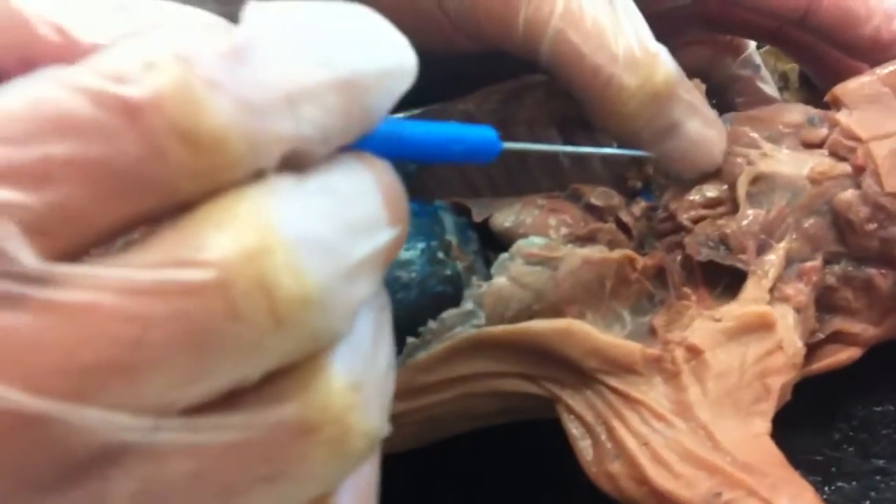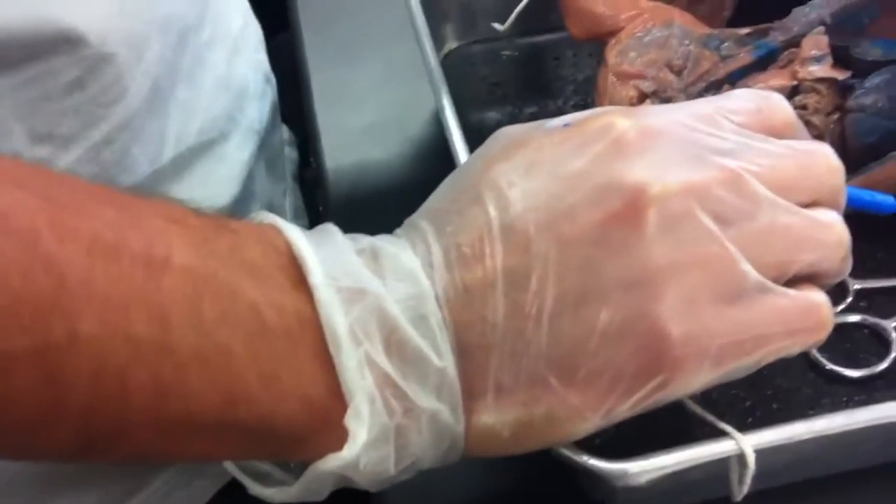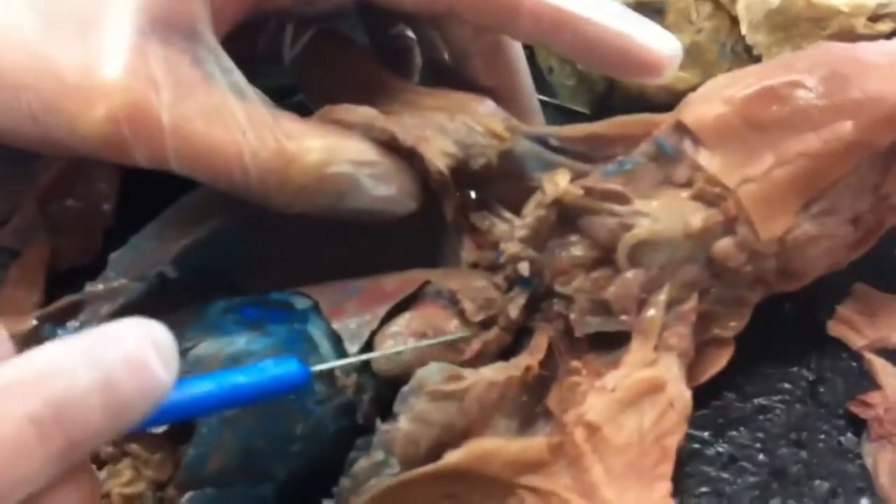And then the thymus. What's the thymus part of — the circulatory stuff? Look for page 44. Thymus. The thymus is on top of the heart, that's right. On top of the heart right here. This little part right here.